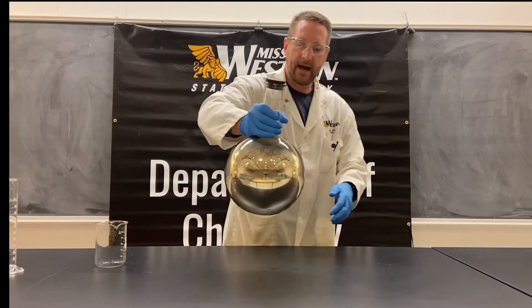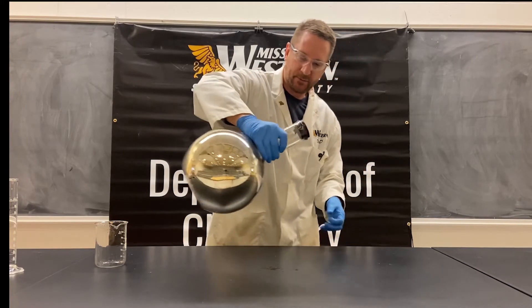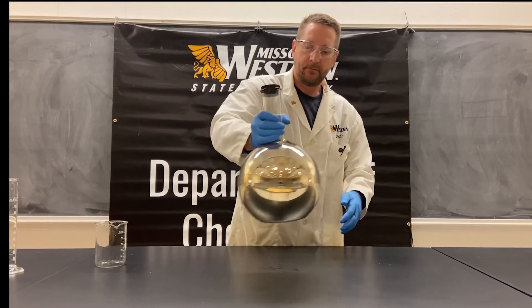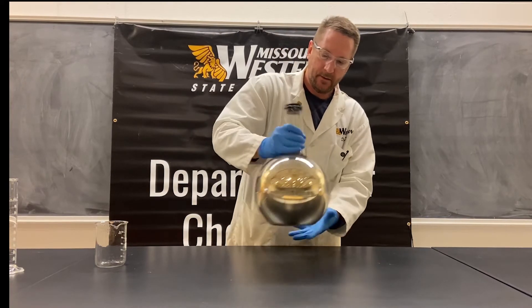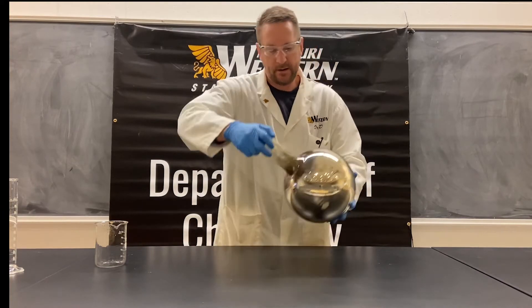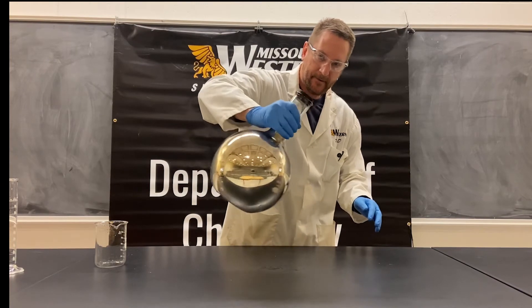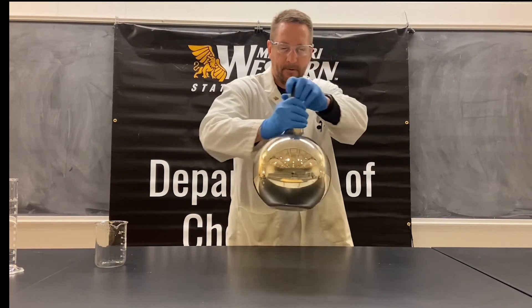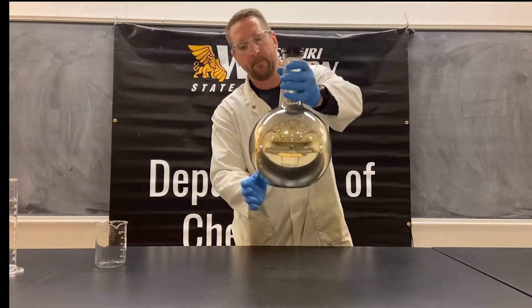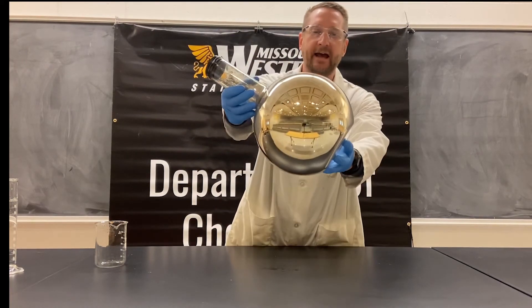Getting a really nice mirror — trying to get it evenly coated. This is a pretty big flask, but we can get it up into the neck a little bit too. And there you go: a silvered Florence flask.